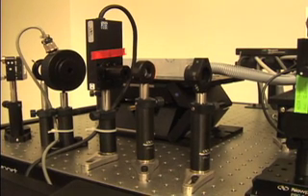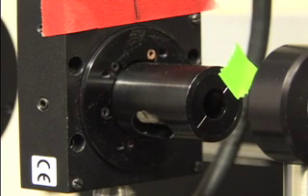The laser beam traps sperm by transferring its momentum to the sperm cell. Once the sperm is captured, the laser power is gradually reduced using a polarizer.